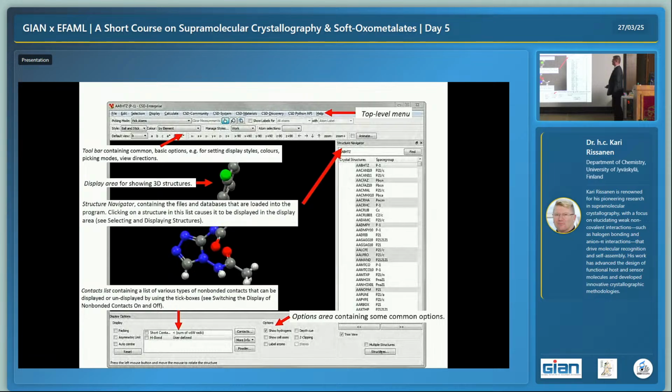I will demonstrate. And in here, we can also exclude hydrogens, all these kinds of things. This is something you learn by doing, to see how it works. And the status bar can give you some help messages. But it's very intuitive. It's a very easy program to use.